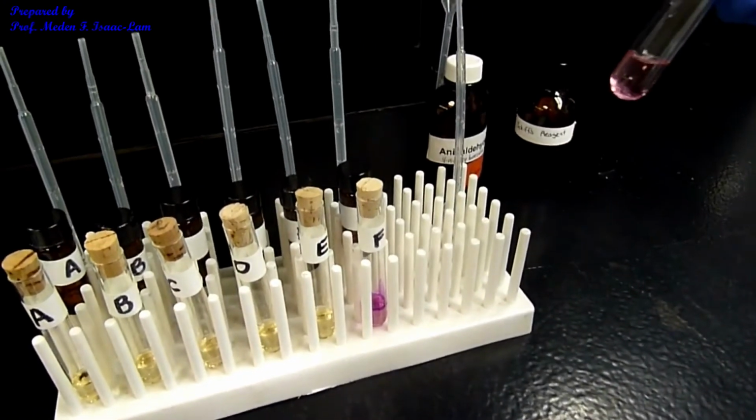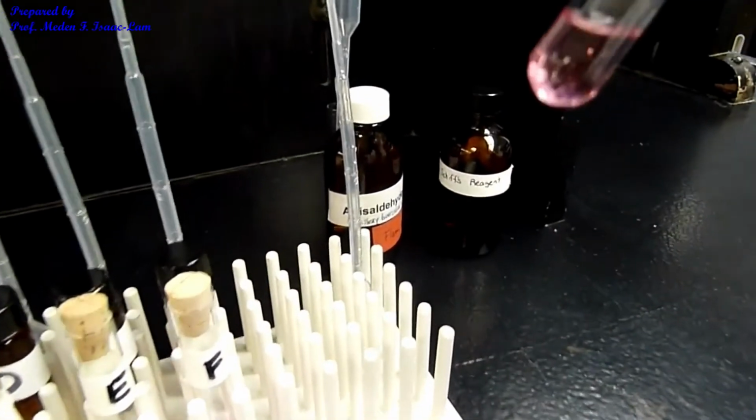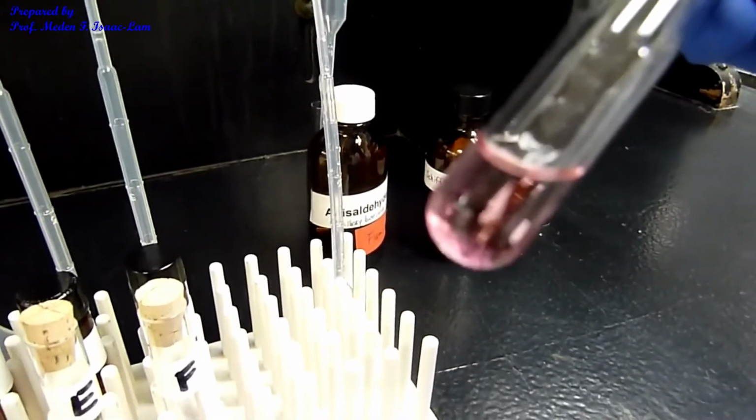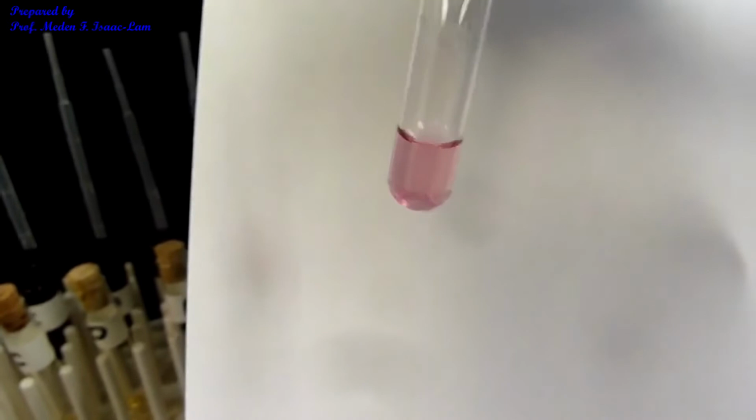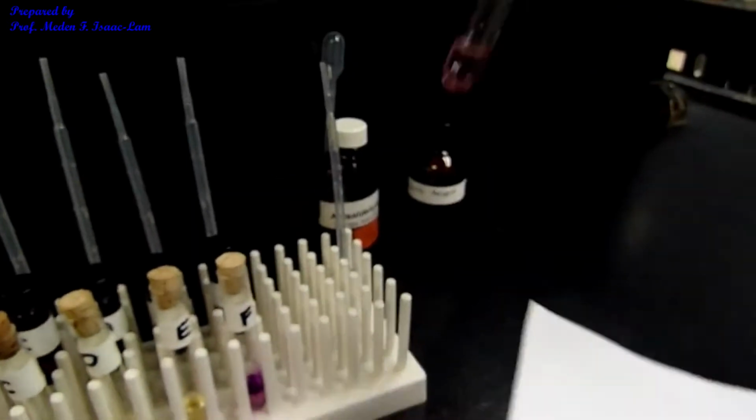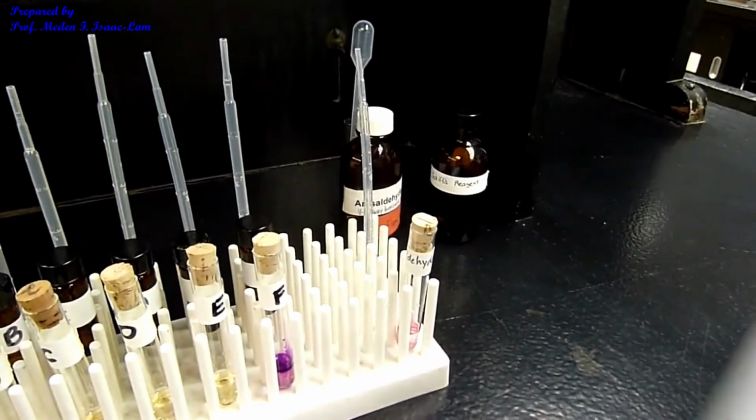So this is the positive test for aldehyde, which is a magenta color for the standard anisaldehyde. So you see the color of the anisaldehyde, it's magenta in the white background. And now we compare.